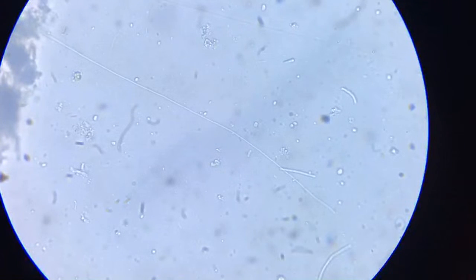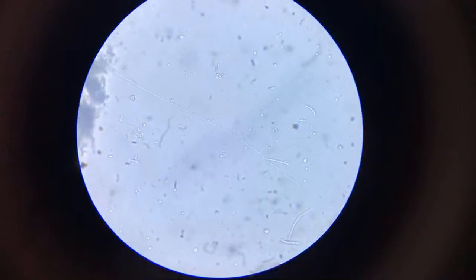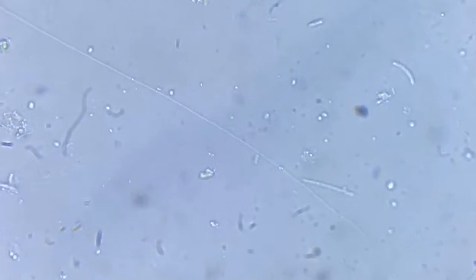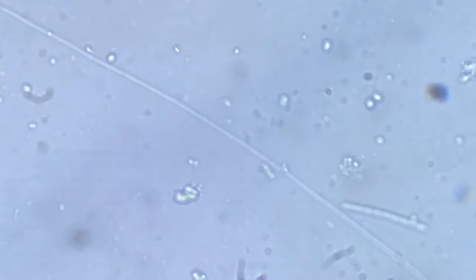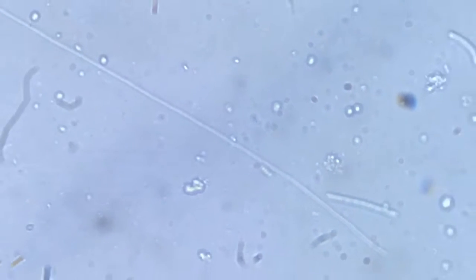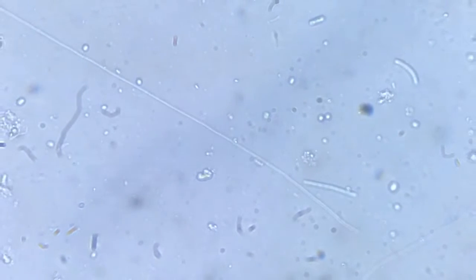We can hardly see it now. This is at 400 times magnification, 500, 600, 700 times, 800 times approximately. And you can see the length of this worm.